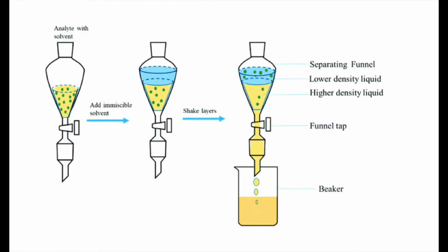Extraction is a separation process that consists of separating a substance from a matrix. Liquid-liquid extraction will be used in this experiment. We can pull a compound of interest out of a liquid if we use a second liquid that is closer in polarity to our compound. This is based on exactly how the analyte, or our essential oil, moves from the initial solvent into the extracting solvent. Simply put, this is a separation based on solubility.